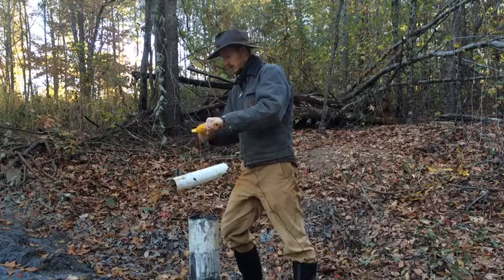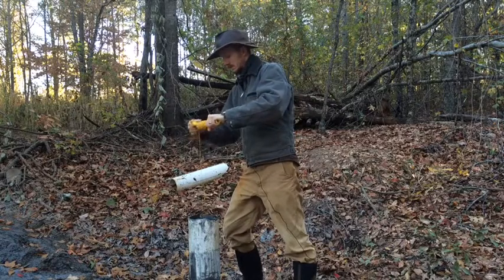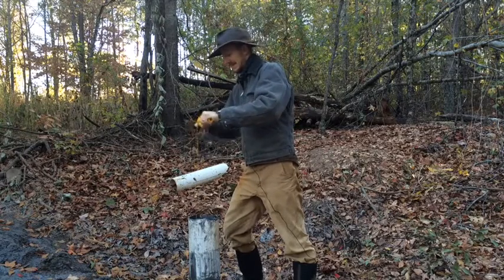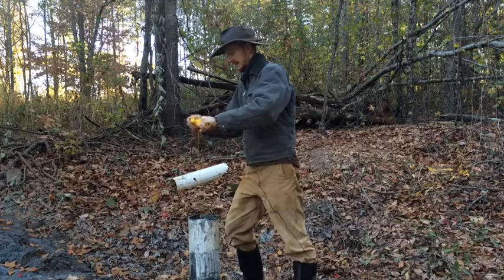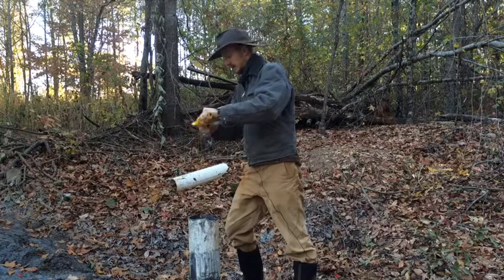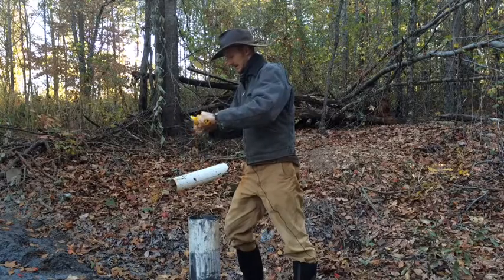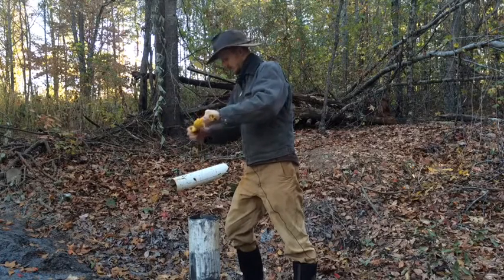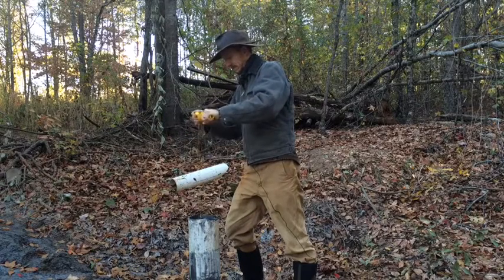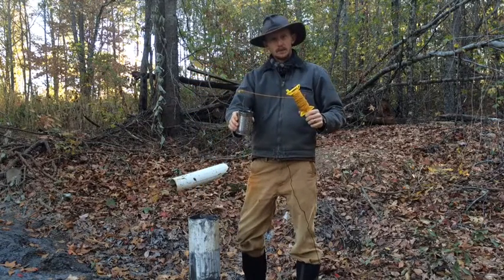Now I'm going to reel it up. You want to make sure that you have a nice strong string so that you don't accidentally drop your sample can down in your well — that would not be fun to try to retrieve. Here we go. As you can see, we have our nice water sample here.